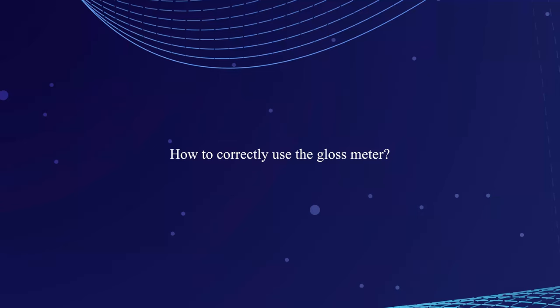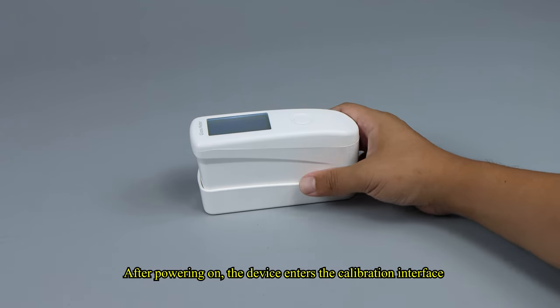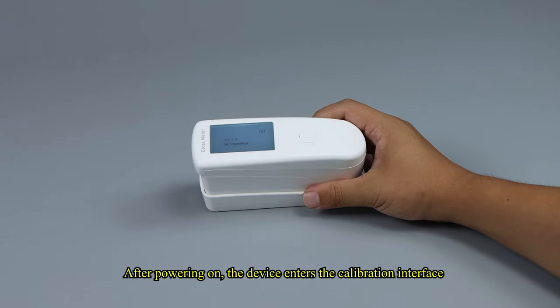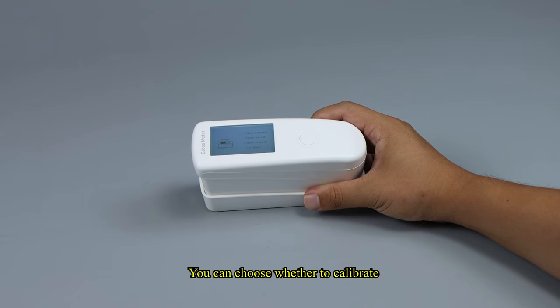How to Correctly Use the Gloss Meter. After powering on, the device enters the calibration interface. You can choose whether to calibrate.